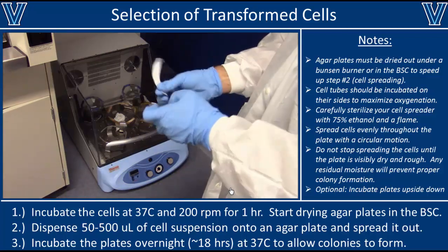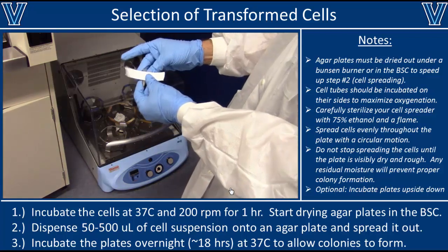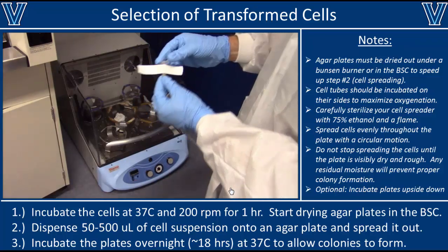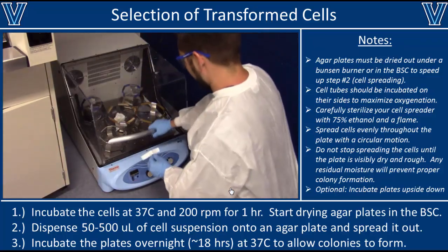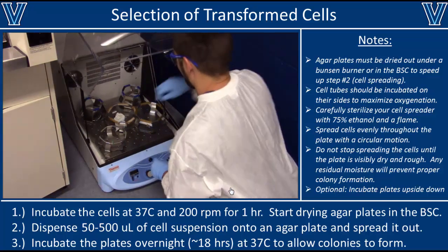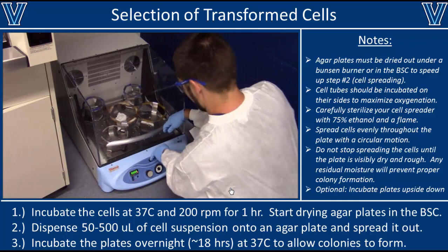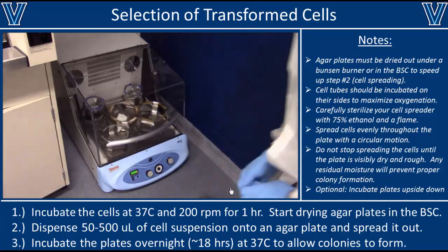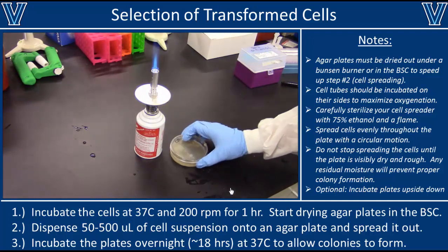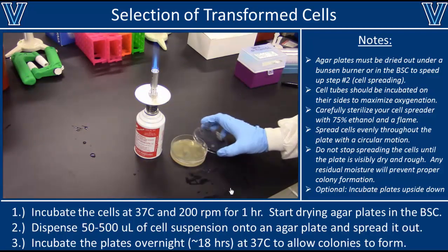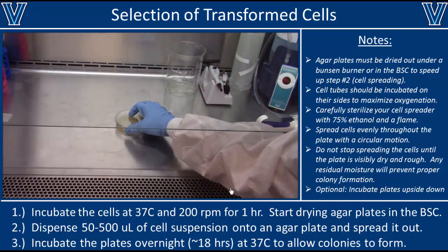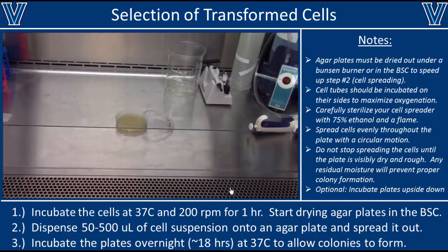Once you've added the media to your cells, incubate them at 37 degrees Celsius with 200 rpm of shaking for approximately one hour. You can keep your tube in place with a piece of tape, but make sure it's securely attached. While your cells are shaking, take your agar plates out of the fridge and let them dry out underneath a Bunsen burner or in the BSC — drying the plates will help them absorb the cells we add later.